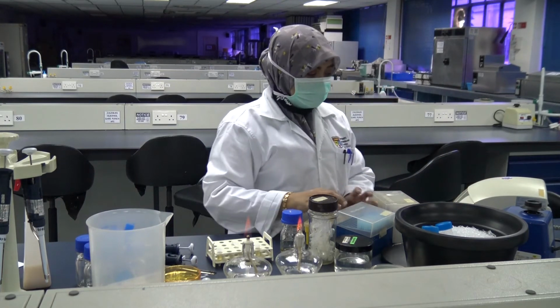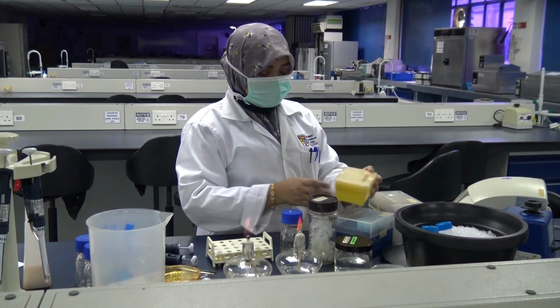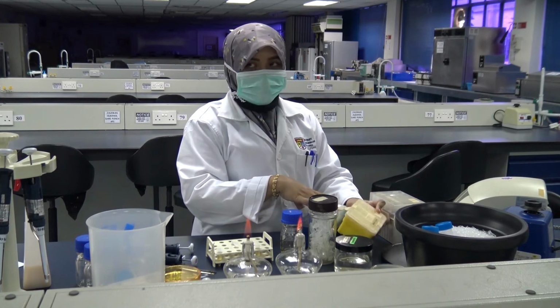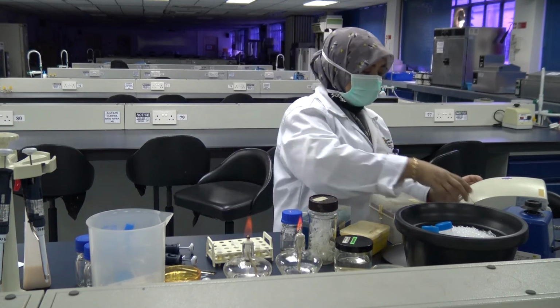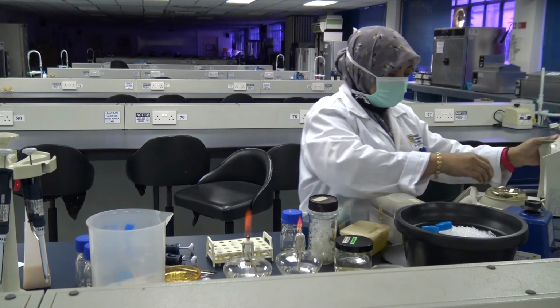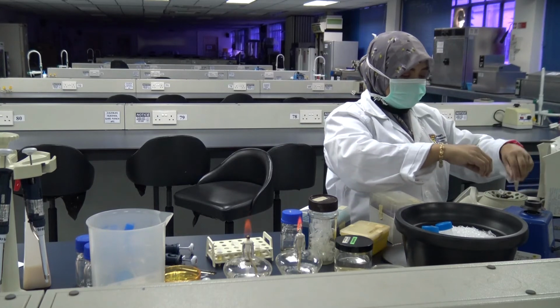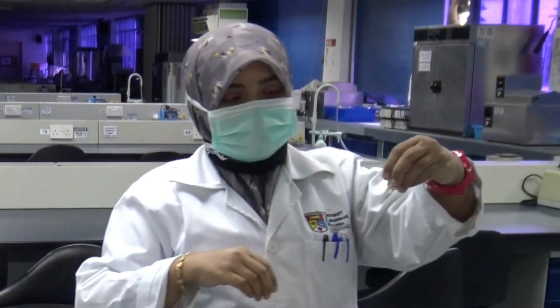Centrifuge at full speed for 1 minute. Centrifuging the tubes for 1 minute would allow the cells to sediment to the bottom of the tube, thereby creating a pellet, a cell pellet shown here.